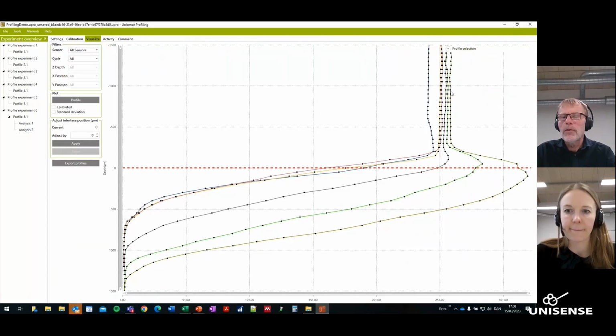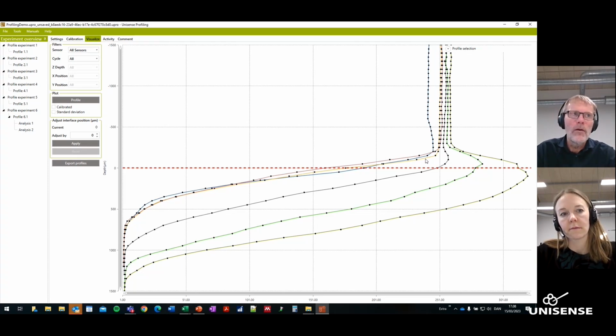So there are a number of profiles here measured at different light intensities. Those here, for example, you see that light going down and down and down, and you can have a sediment in light where there's oxygen production, but you do not have a peak because the production is so low that it's cancelled out by the consumption, so you don't see the peak, even though there is a production going on. You would see it then if you turn light off completely, and you see you have even lower oxygen concentration. Then there would have been a production, and you can also measure that production using the light-dark shift technique.